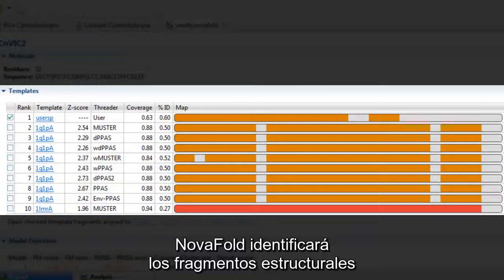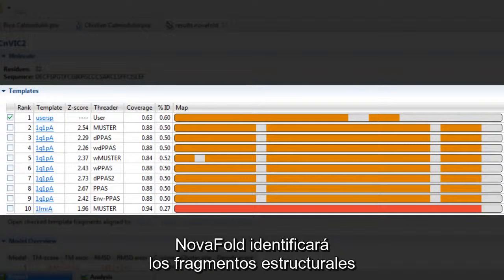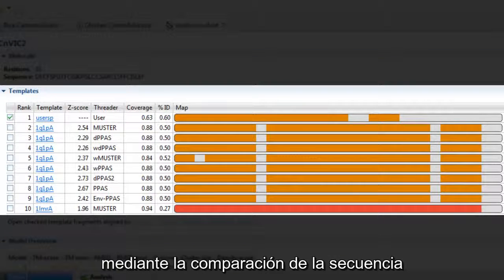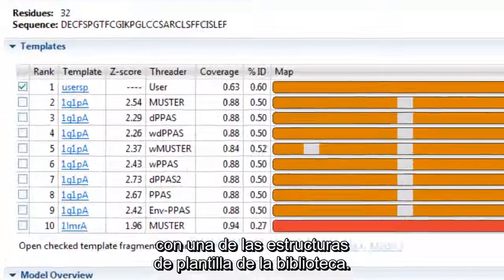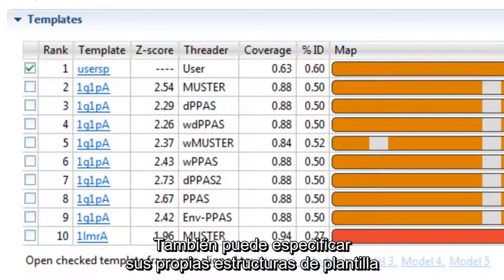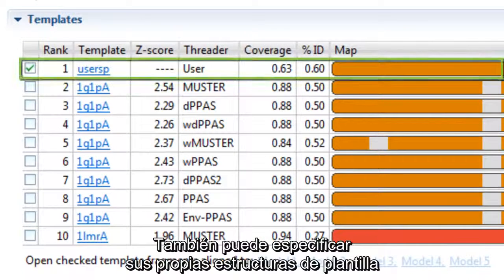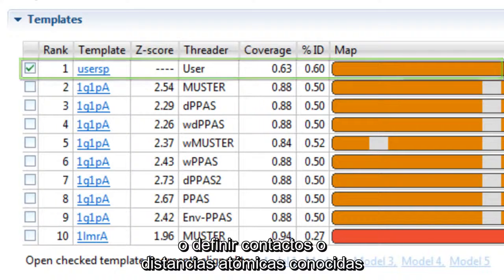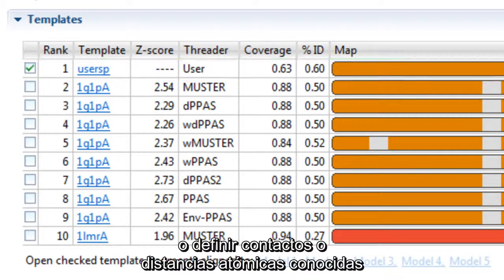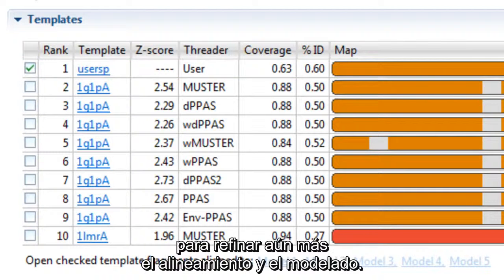NovaFold will identify structural fragments by comparing the sequence to a library of template structures. You may also specify your own template structures or define known atomic distances or contacts to further refine the alignment and modeling.